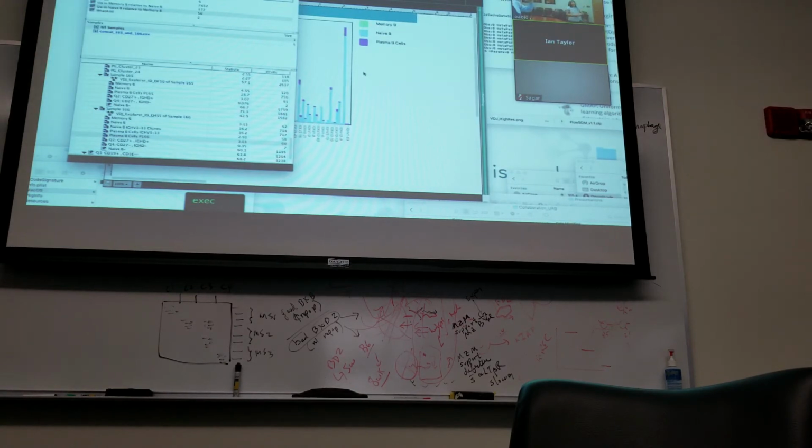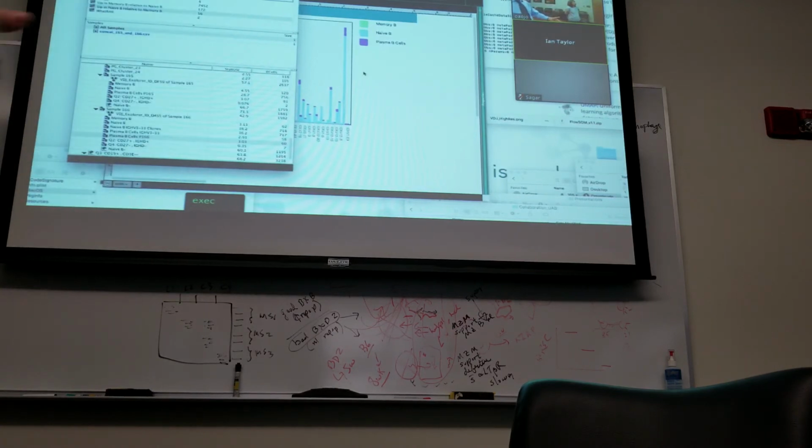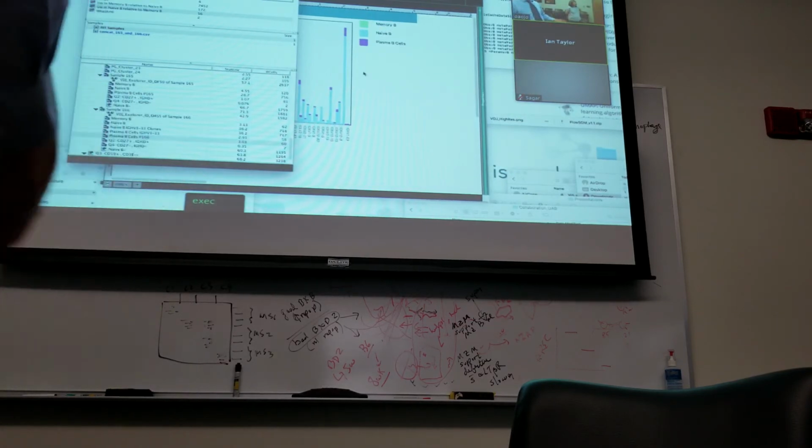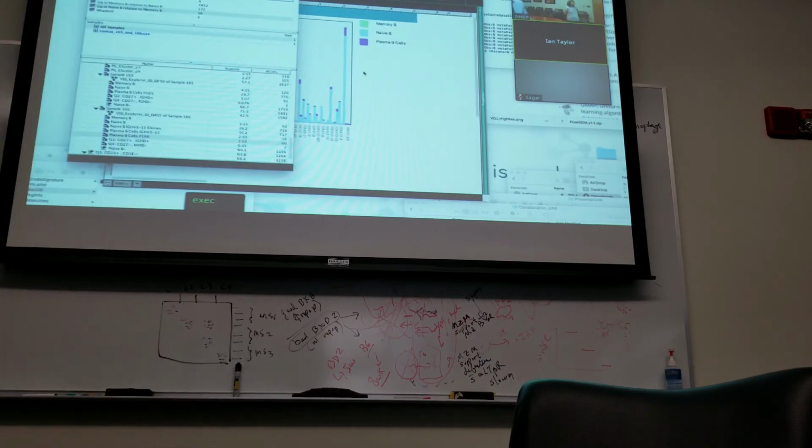Oh, right, yeah, we can take this and go back to that, because that's actually our naive and plasma cells, from surface markers that are accepted. This is kind of guessing at the gene level which are naive and which are plasma. But we can compare the new data, we have it on two subjects, with what we get here, and see if we're really identifying plasmablasts properly, and it'll become confirmatory. So this is the big question. This is it. And then, what is the difference between those plasmablasts?